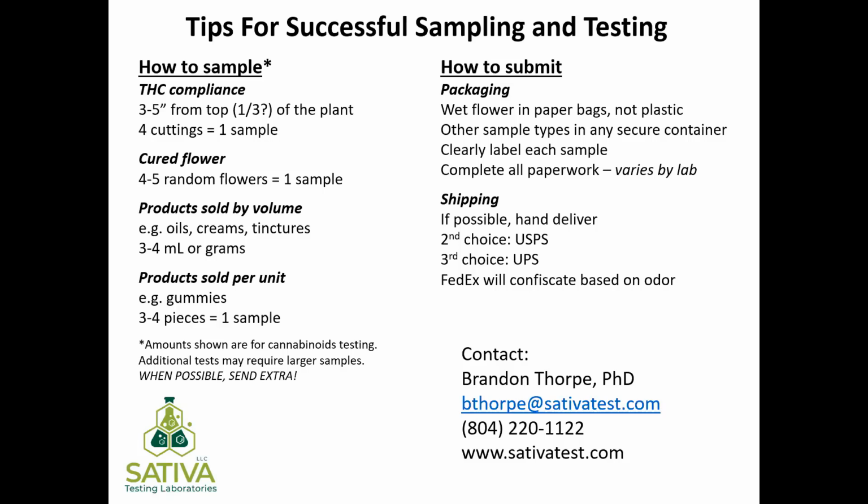Of course, as I said before, if you're submitting for microbial contamination, make sure it's sterile. But other than that, labs are really not that specific on what containers you use. The big thing is clearly labeling them and completing all the paperwork. As I said, the paperwork does vary by lab, but as I mentioned, that is the start of that legal documentation, in case, unfortunately, something were to happen, or someone came after you for some reason.